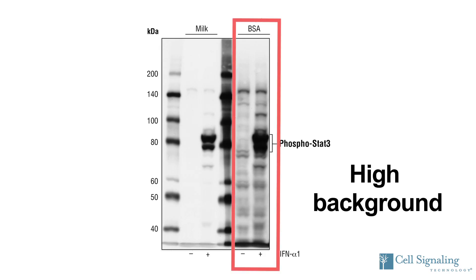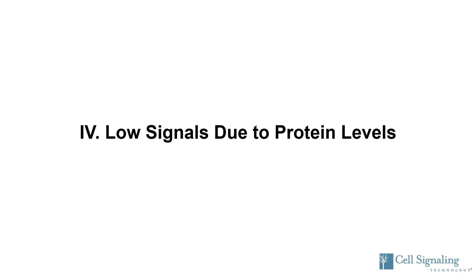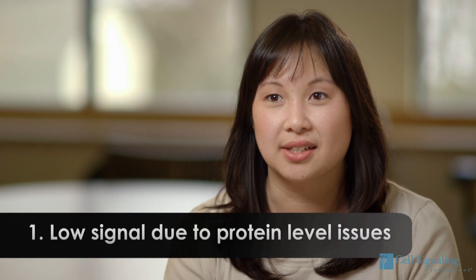Poor Western blot results can be generally classified as either low signal or high background. The signal is considered low for most targets if the protein of interest cannot be detected after 30-second exposure of the blot to film. High background is defined as having a generally dark background or nonspecific bands appearing after 30-second exposure of the blot to film.